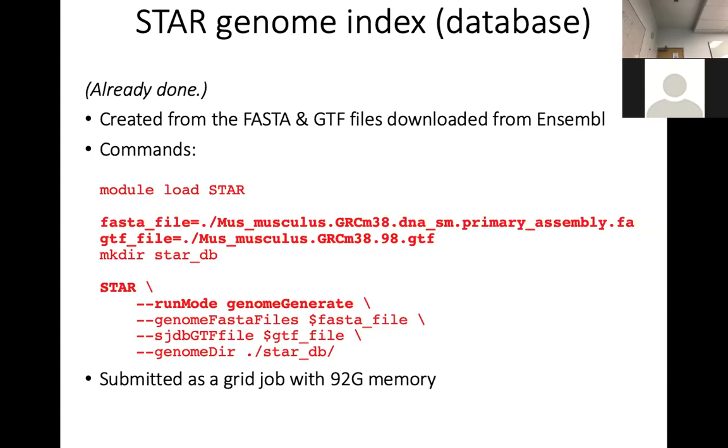So one thing that's good is whenever you have a program, just use the dot slash from the present directory. The dot slash literally means the address you're going to use from the present directory. And then it's directly into the second directory, right?